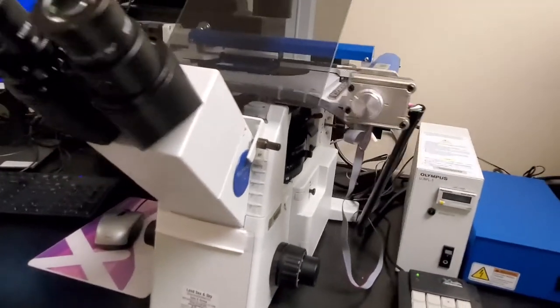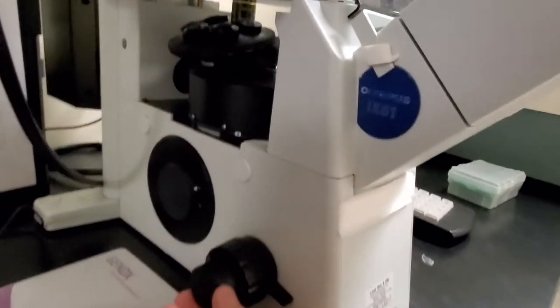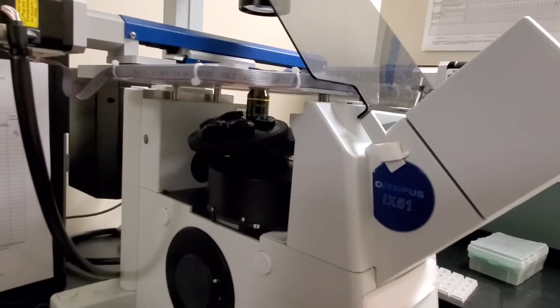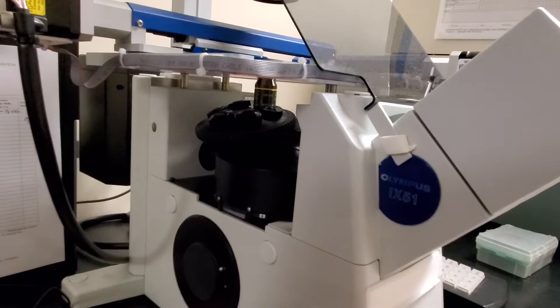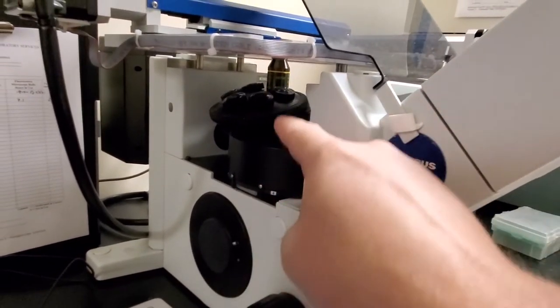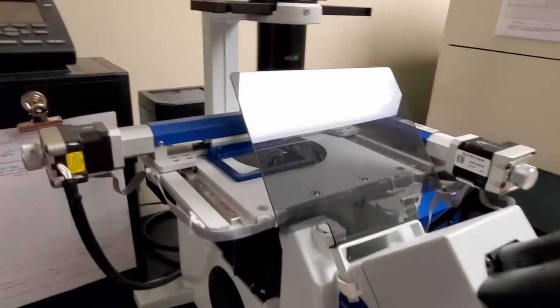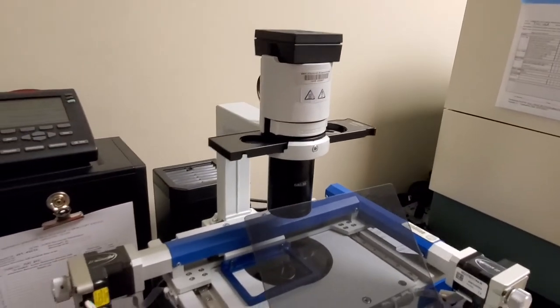So like a traditional microscope, it's got a binocular in the front, but here you got your down tube. And when you adjust these knobs, instead of adjusting your stage as you would expect a microscope to do, what you're actually doing is moving your objective up and down. So it's inverted in almost every fashion. This one's got a camera mounted to the top for recording.